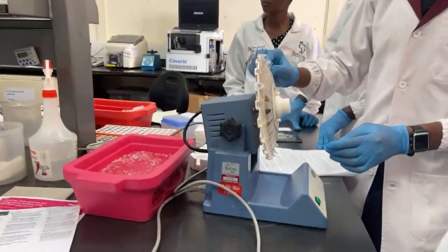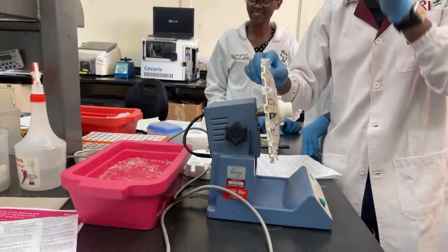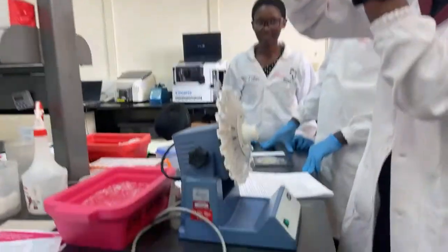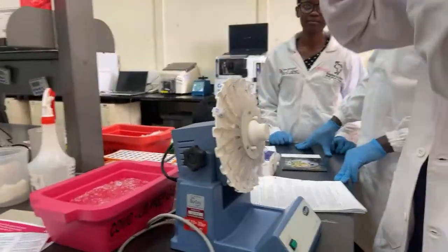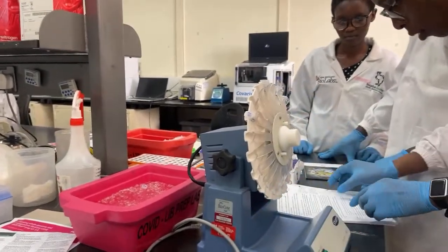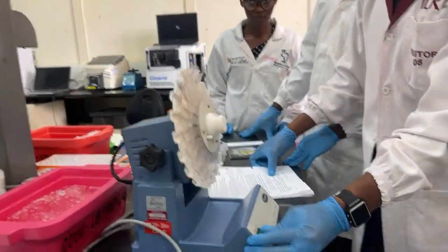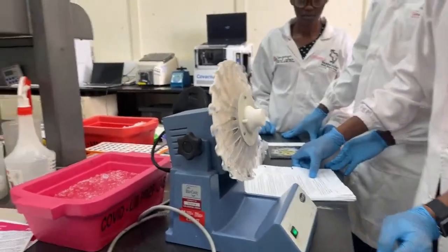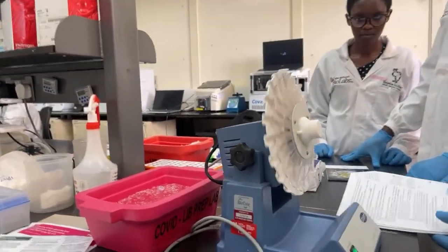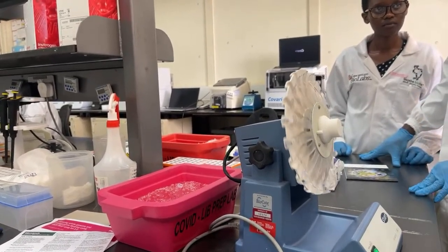Can we have another one? Number one. Number 4. That's there. For how long? For 15 minutes. Someone is telling me, does it also have different speeds? Yeah, just different speed. So this one 20 RPMs.